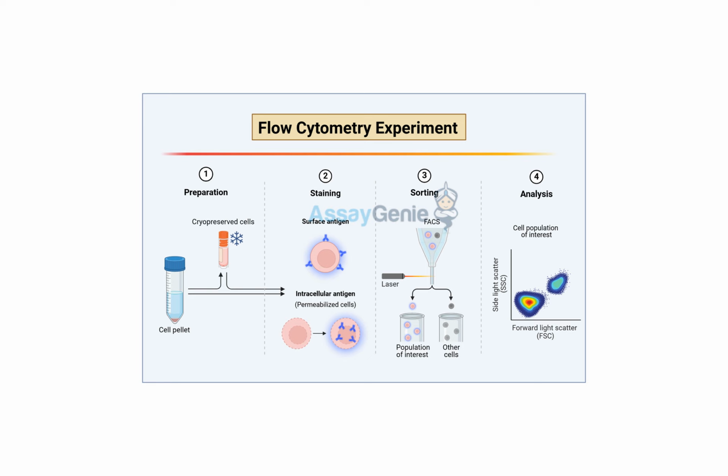But those phosphate groups, they're kind of fragile, right? They can be easily removed. So we need to be extra careful to preserve those modifications during the experiment. Absolutely. So we need special antibodies that only recognize the phosphorylated protein. Yes, and techniques that prevent dephosphorylation.